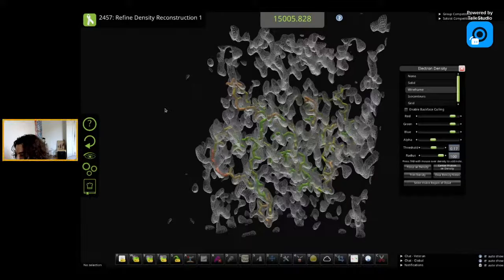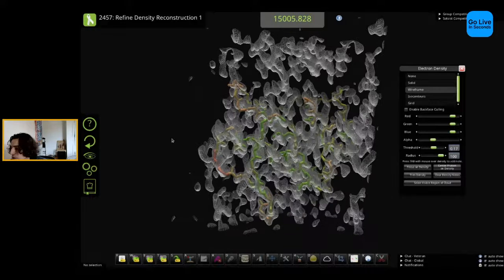A cohesive metric to indicate when this happens. So there is the statistic R-free that gets used a lot in crystallography to show how agreeable a model is with crystallographic data. And there has been talk about adding an R-free calculation into Foldit, in particular, to go along with this new tool.